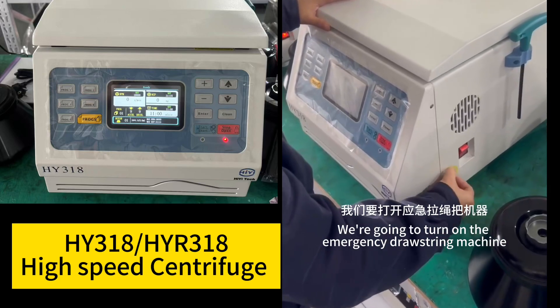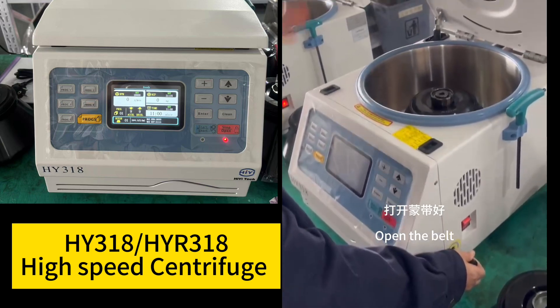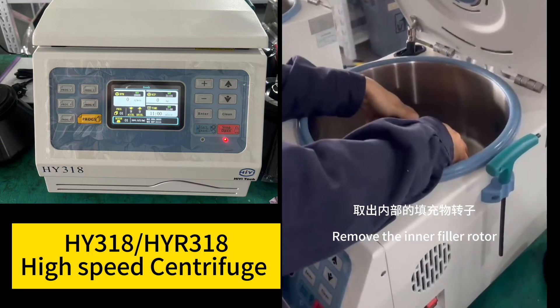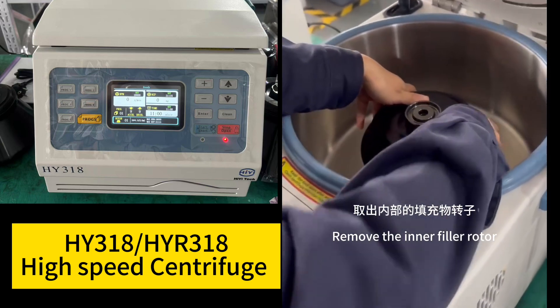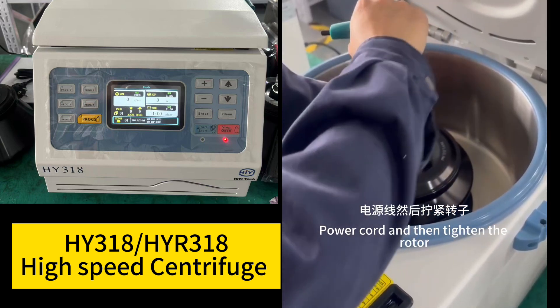After receiving the machine, turn on the emergency drawstring machine, open the belt, remove the inner filler rotor and power cord, then tighten the rotor.